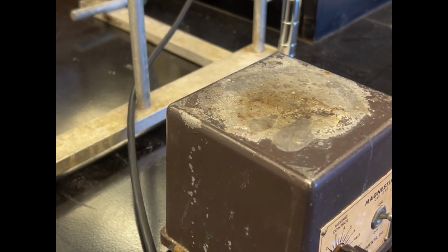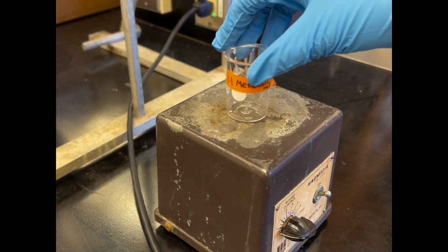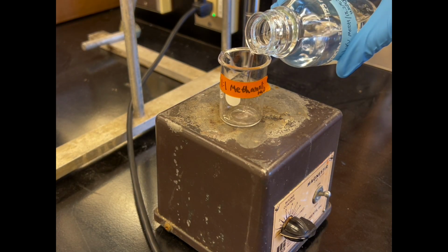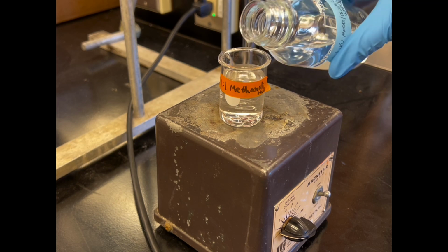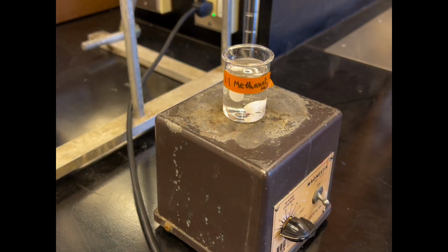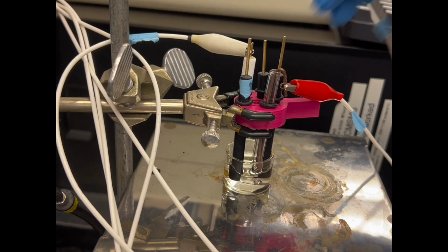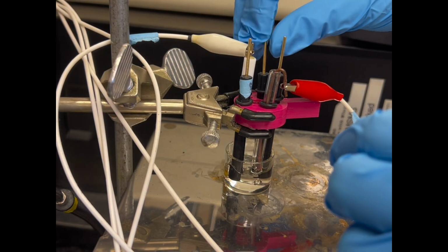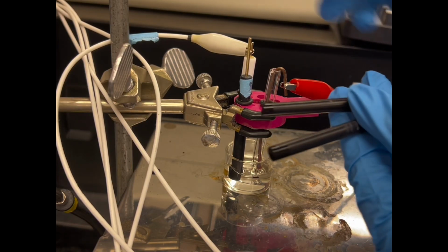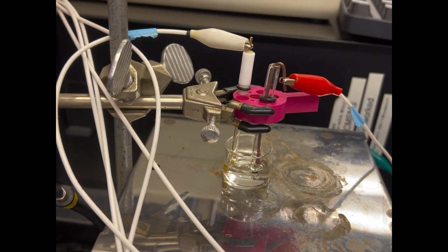We'll set up on the magnetic stirrer. Let's pour about 25 ml of the 1:1 methanol and pure water solution and put a stir bar in it. We take the 3 electrodes together to rinse them with pure water, but make sure we take a waste beaker to collect the PFAS waste because we don't want to dispose of it into the drain. That would be very harmful.